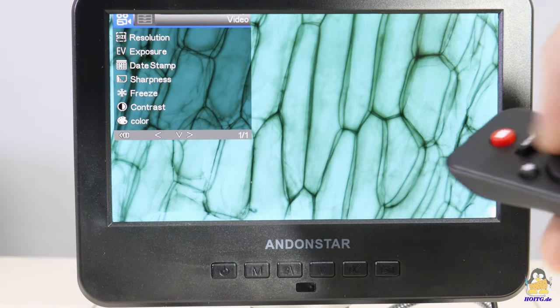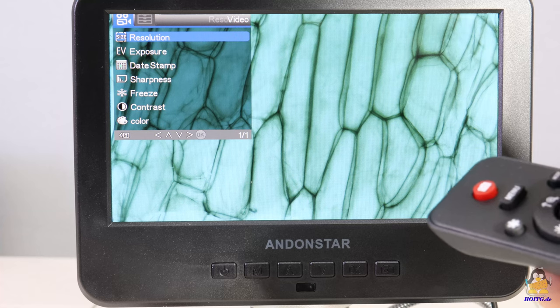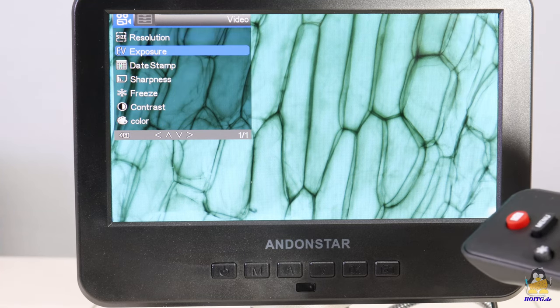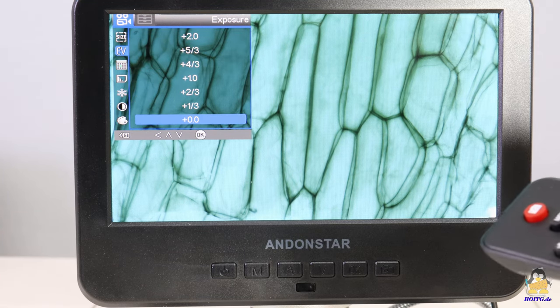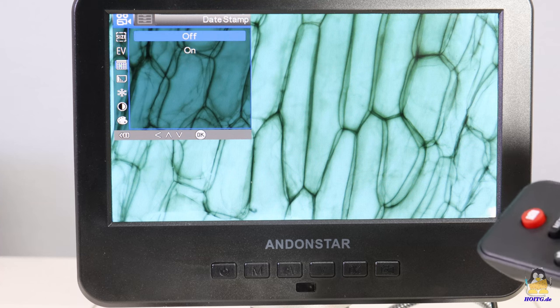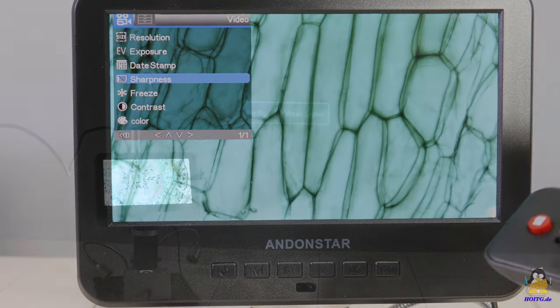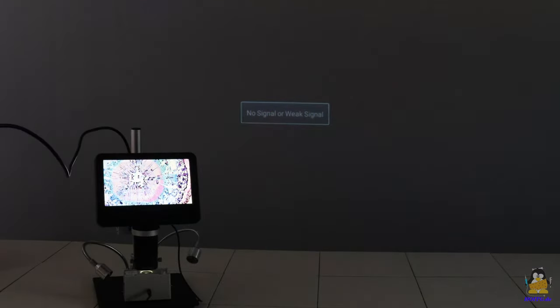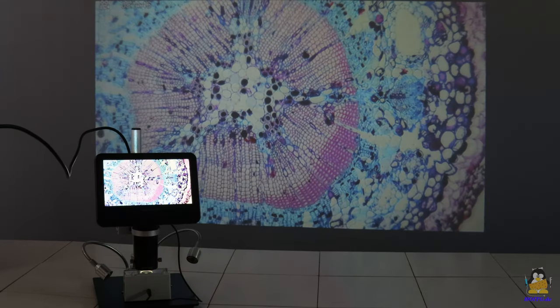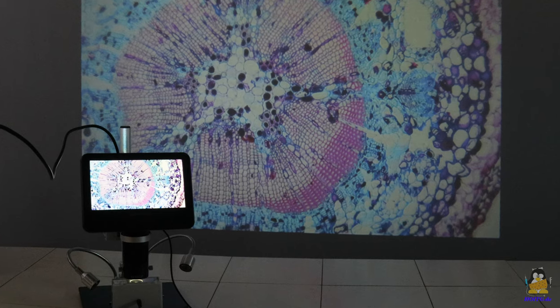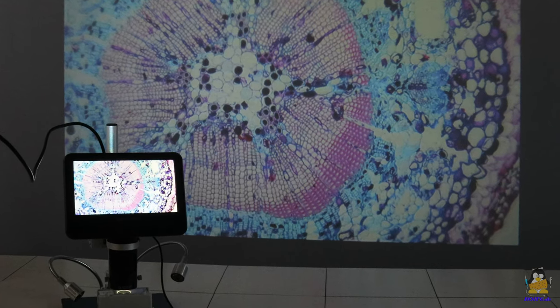Not only can still images and video sequences be recorded by remote control, but all settings can also be made. If the 7 inch screen is too small for you, you can connect a larger monitor or a projector via the HDMI interface. The microscope is therefore also suitable for presentations in front of a larger audience.